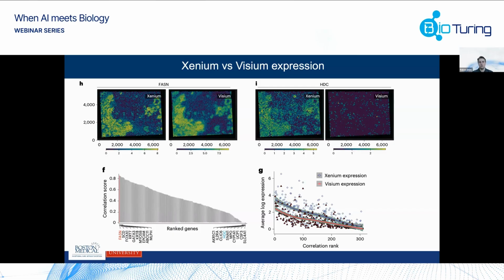Tell us which genes are agreeing between the two technologies, and they should agree, versus which ones do not. What we see using this data set is that overall there's a positive spatial correlation between the two. It does seem to drop. And so initially we were like, hey, what is this drop? Is this maybe just because the probes don't work really well, or maybe there's something else, is it gene specific? But what we actually noticed is that a lot of this is just correlating with expression levels.